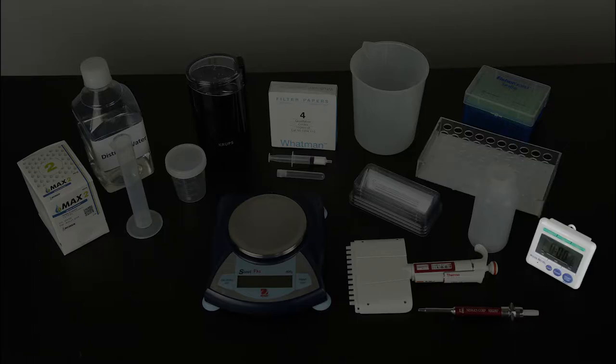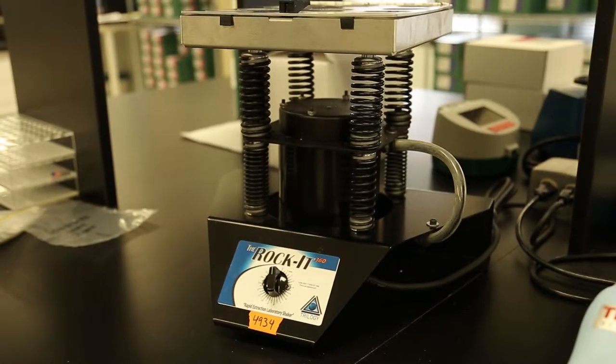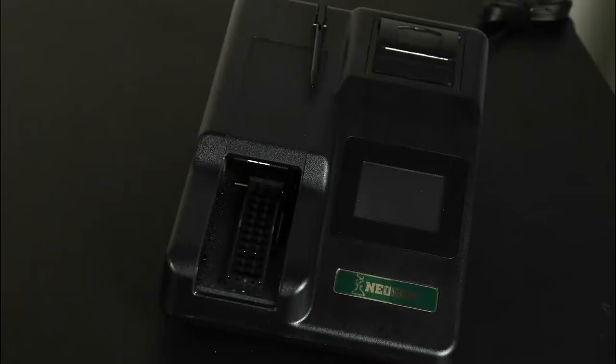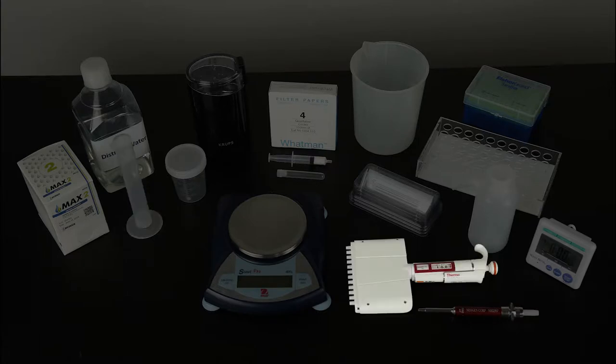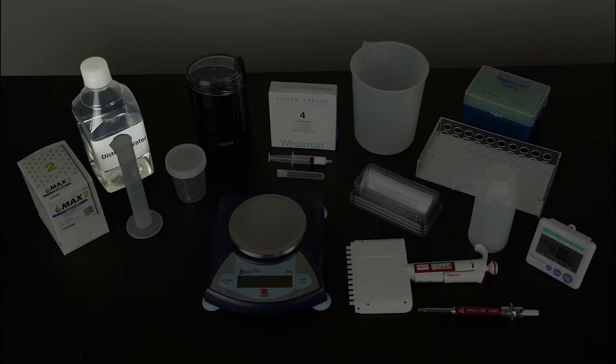You will also need a tube rack, timer, rocker shaker, microwell reader with a 650 nanometer filter, 50 milliliter graduated cylinder, 12 channel pipetter and tips, 100 microliter pipetter and tips, wash bottle, reagent boats, distilled or deionized water, and Max 2 aqueous extraction packets.